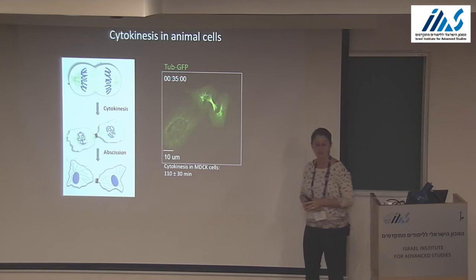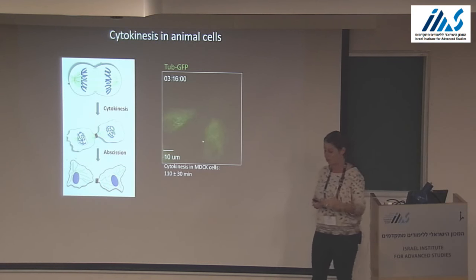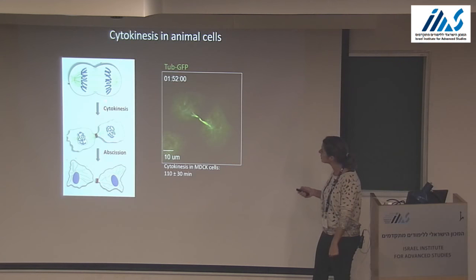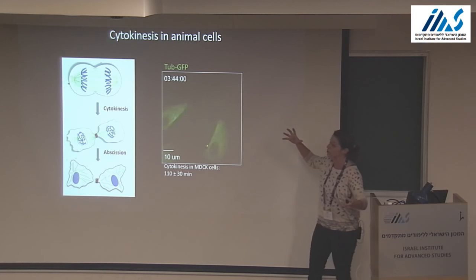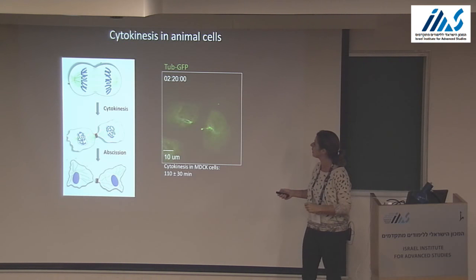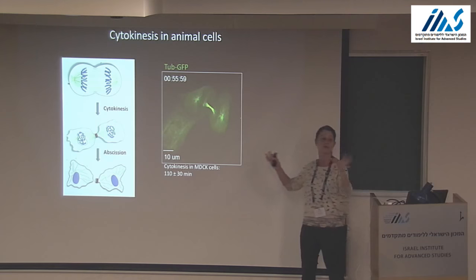But then I joined Jennifer's lab, and at the beginning I actually worked on microtubule acetylation. I really still liked post-translational modifications, and I heard that microtubules undergo acetylation, and the role of tubulin acetylation was unclear. I said, okay, let's do that. One of the major phenotypes that I had is in the last stage of cell division. In cell division, if you just consider the membrane for a minute, then you have this acute actomyosin contraction that pretty much separates the cytosol into two huge domains. But then the cells end up being connected to one another by this 1 micron diameter bridge, and then this membrane has to be cleaved eventually in order to give rise to two fully separated cells.